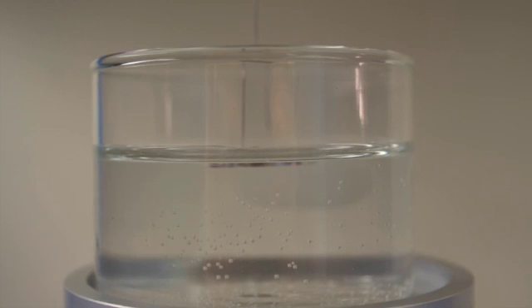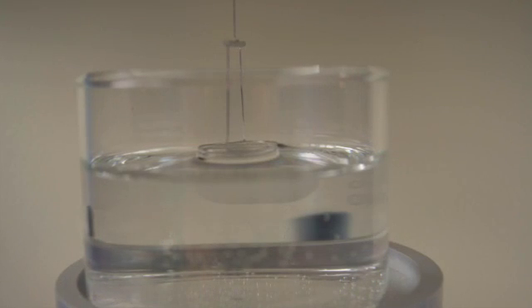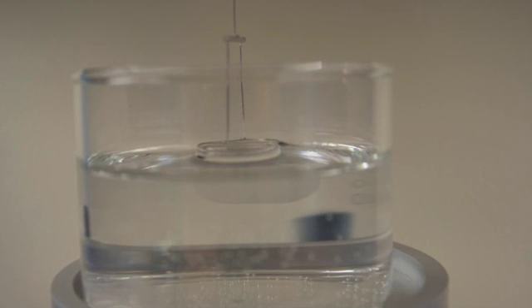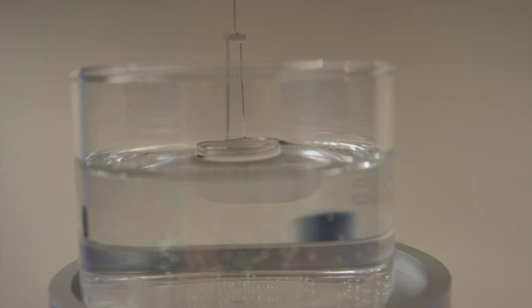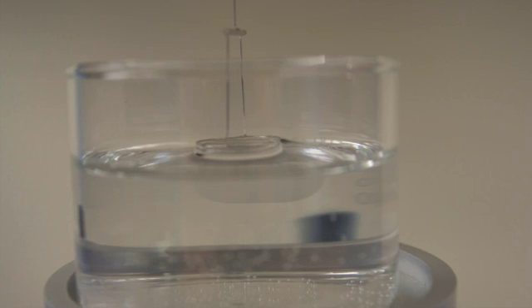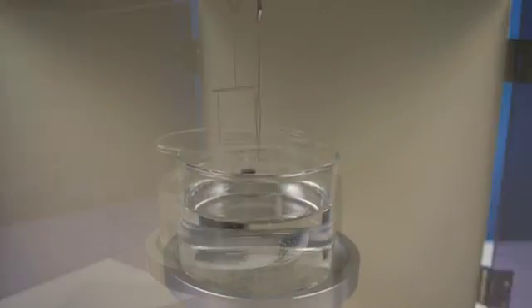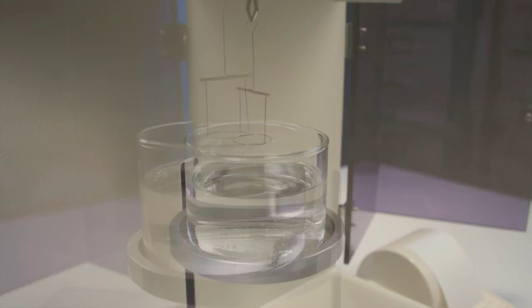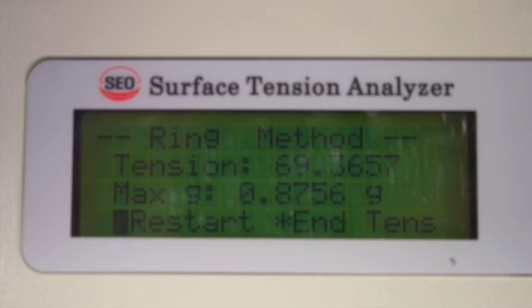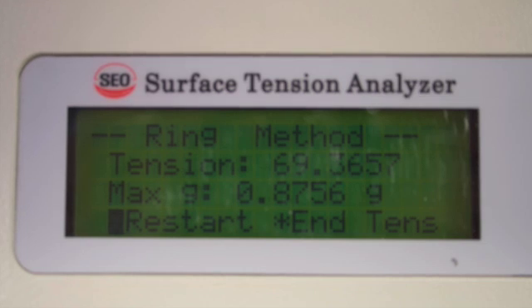Once the Denoy ring is submerged into the liquid, the DST-60 automatically begins raising the Denoy ring up and through the liquid's surface, where the meniscus can be seen pulling from the liquid's surface. Continual calculations of the tension are viewable in the digital readout as the ring progresses upward. Once the ring pops from the liquid surface, a final surface tension in dynes per centimeter is displayed and ready for printout.